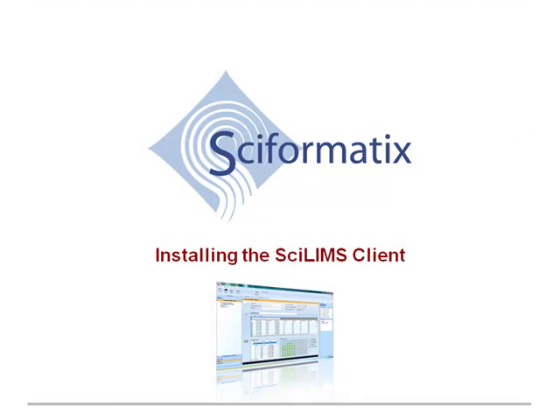In this training session, we will perform an installation of the SciLIMS client software. SciLIMS is perhaps the easiest to install of any LIMS application.